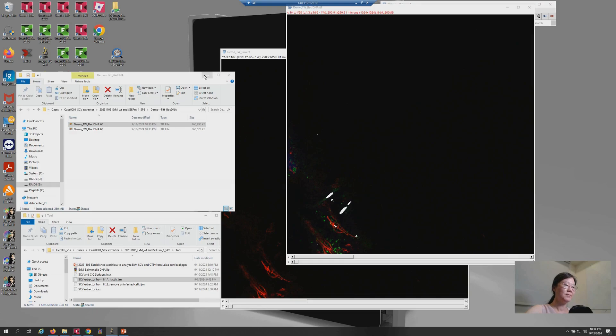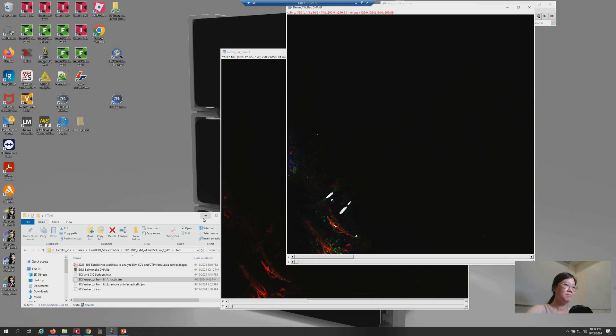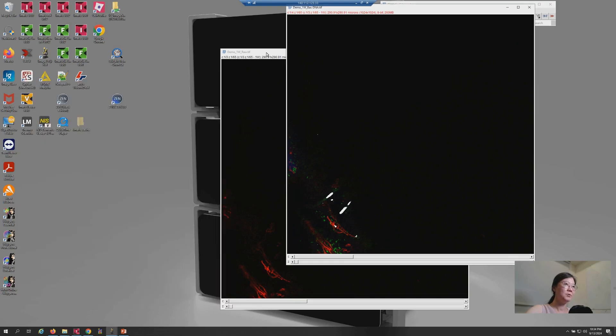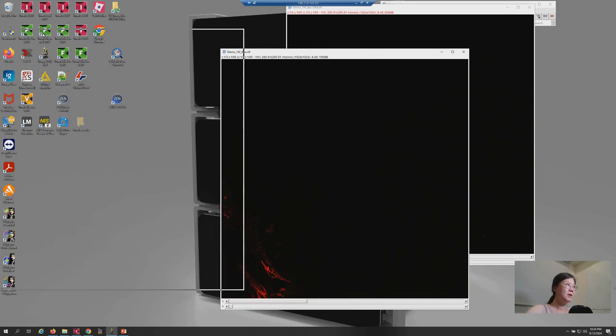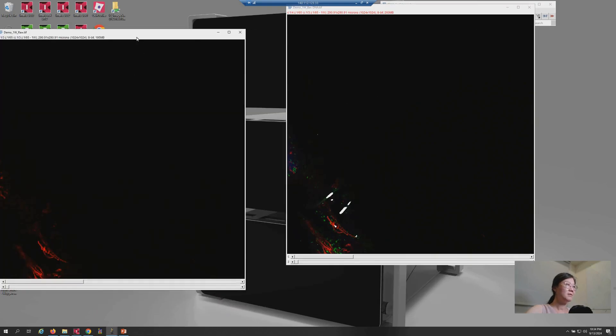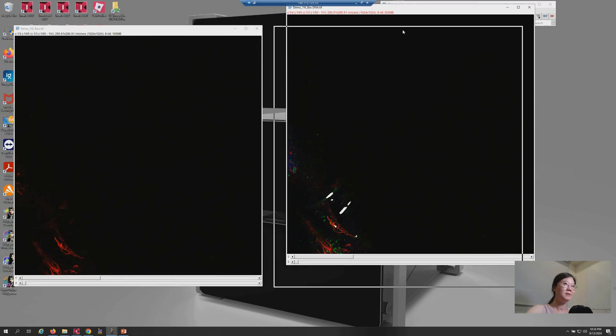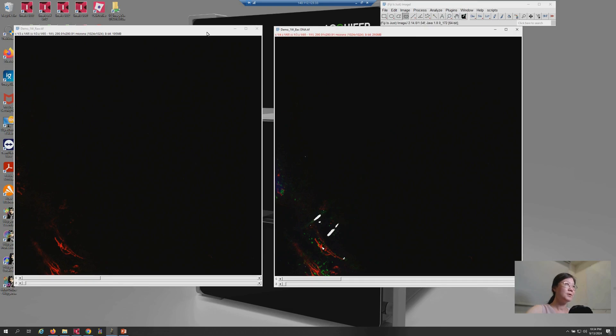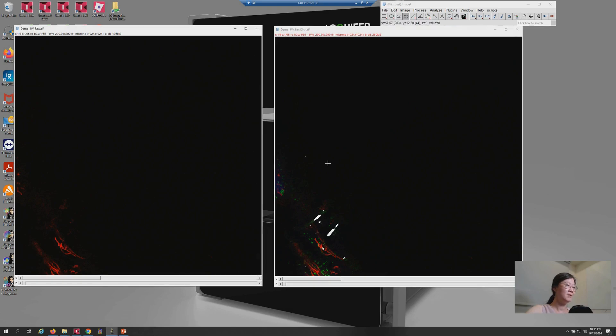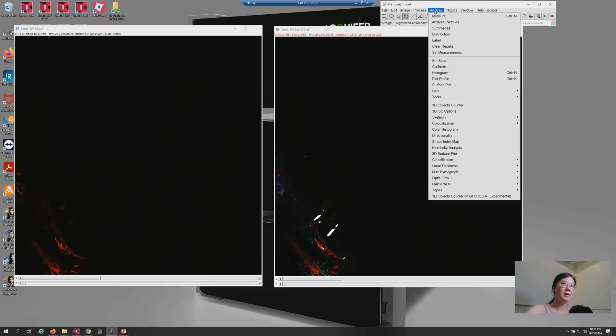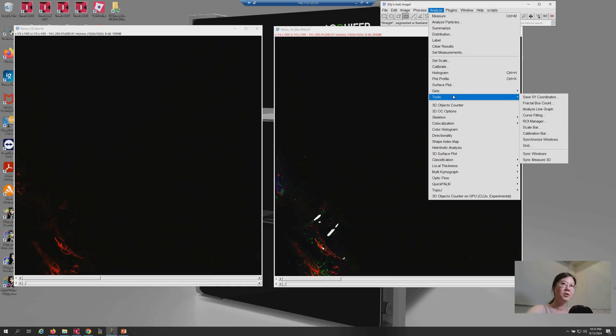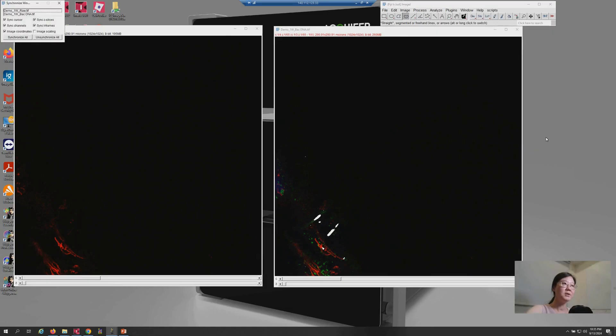Okay. Just make it smoother. So, on the left hand is the raw data. On the right hand is the processed one. So, if we compare channel numbers, the result will have an additional channel, number four, and that is the bacterial DNA. Okay. So, let me use analyze tools, synchronize windows.